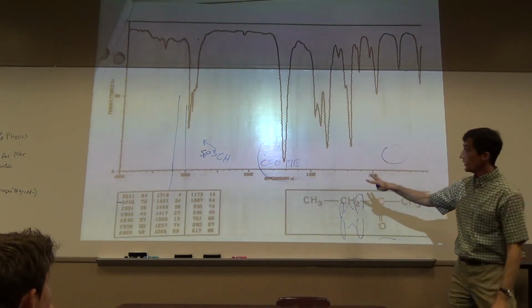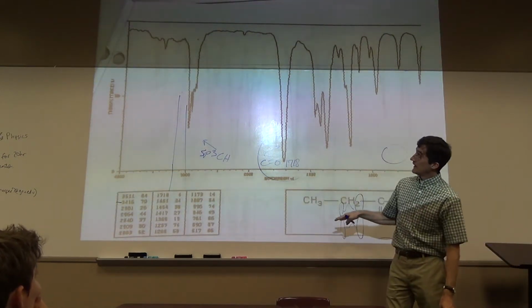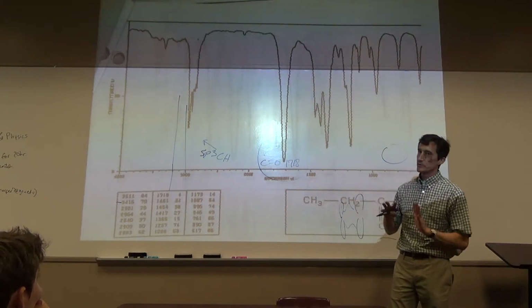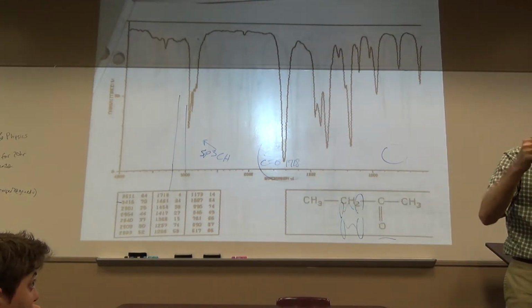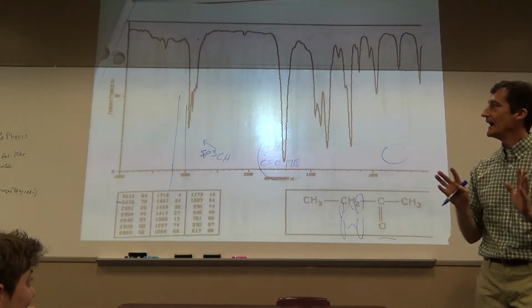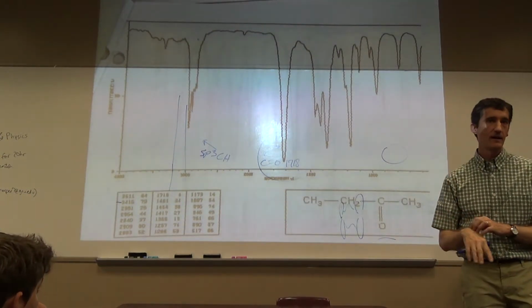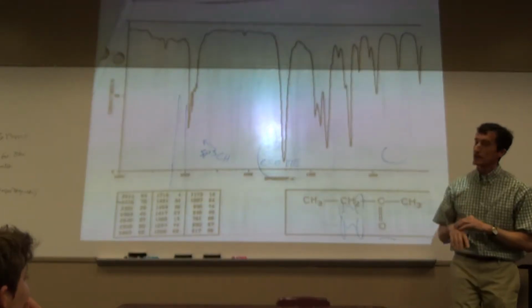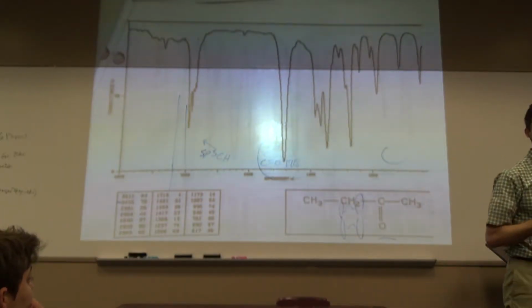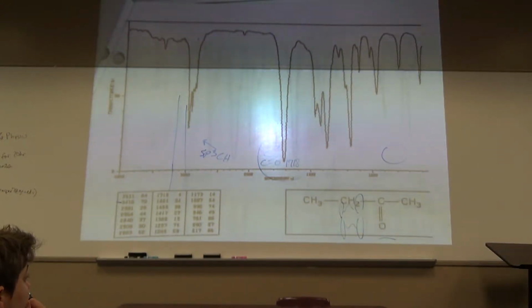Because there's certainly no OH or NH, although it could be enol, and I'll just throw that out there for our big video here. Okay. I've always called it an overtone. Organic 2, we'll see enols. Actually, we'll see enols in organic 1 during test 3. Enol.